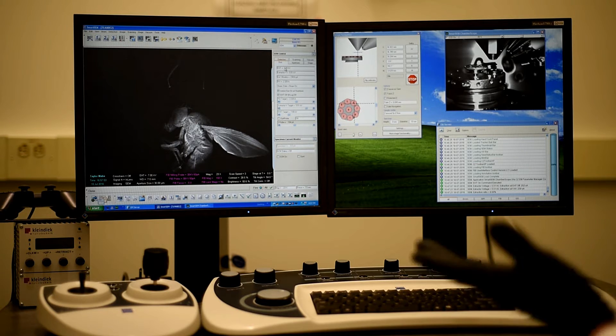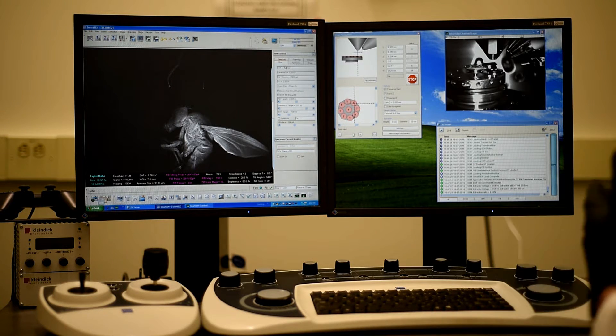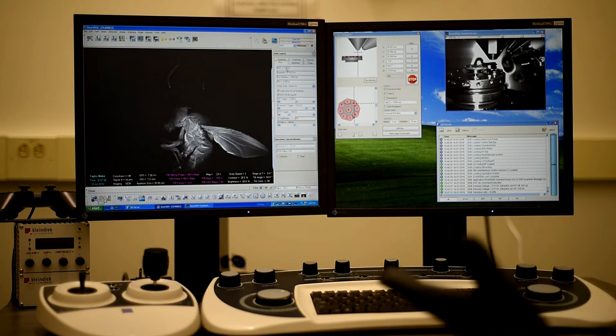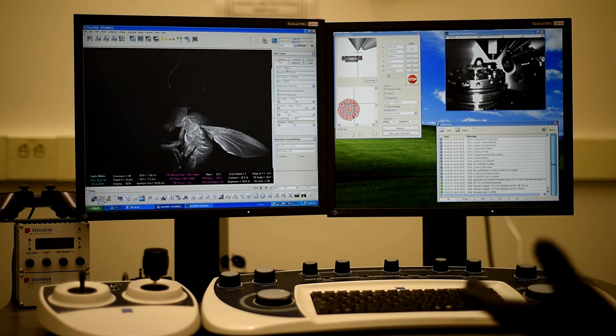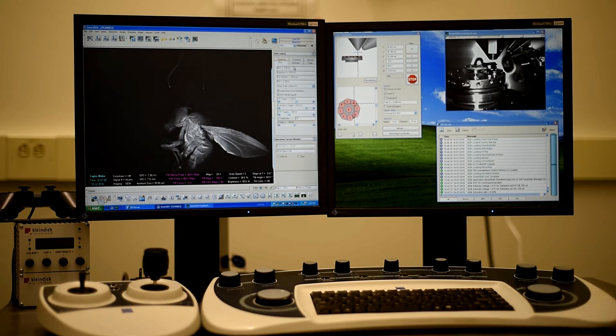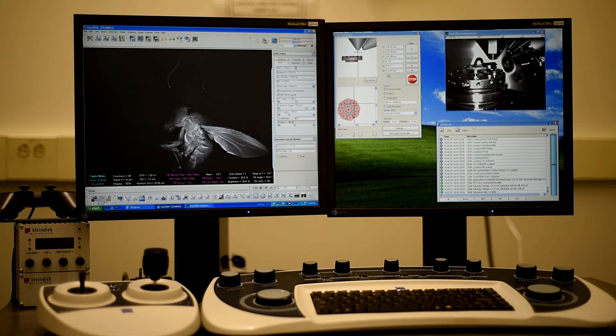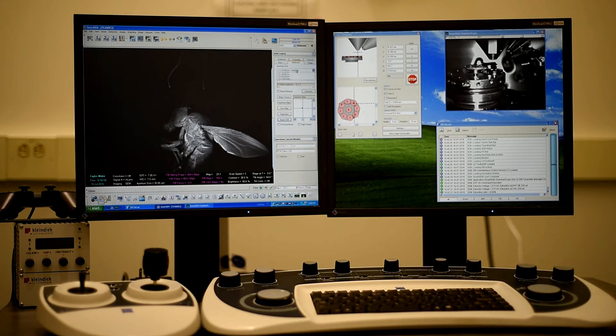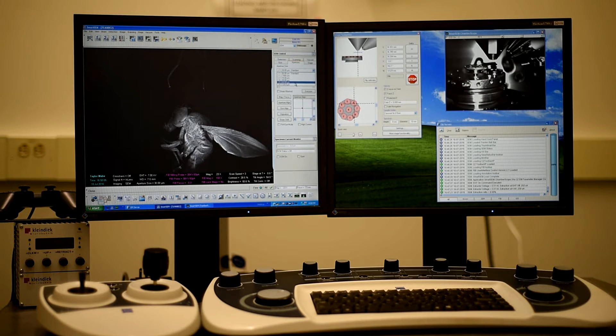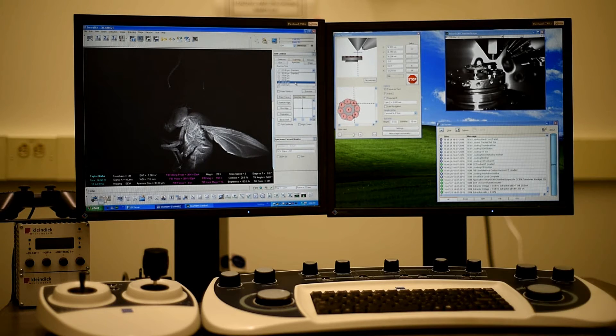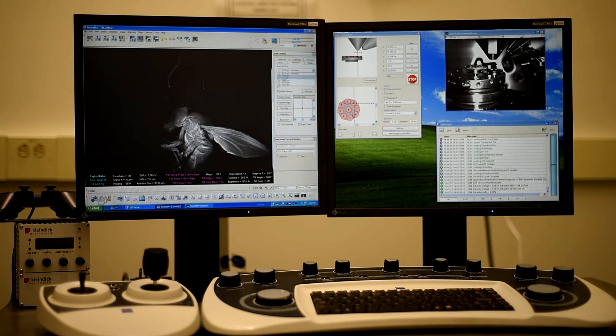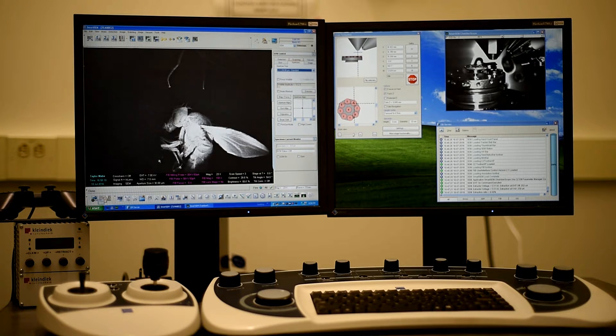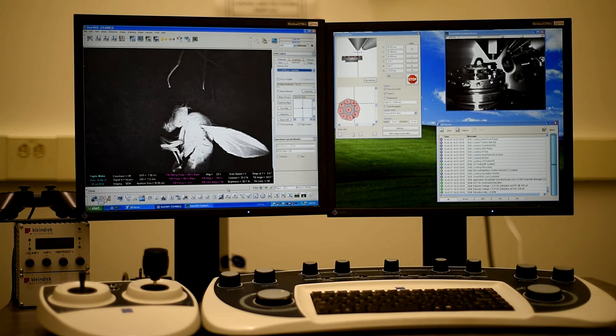The EHT, or if you're under the gun tab, the EHT value, the higher the value typically, the better the resolution for hard things that are metals and whatnot. And the apertures, the bigger the aperture, the more electrons you're going to let through. And you can also click on things down in the data zone and change it.